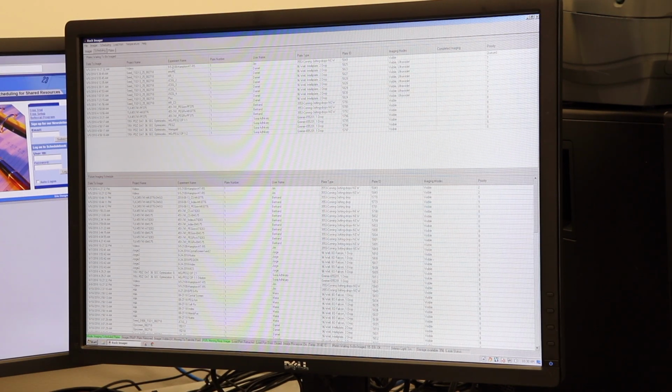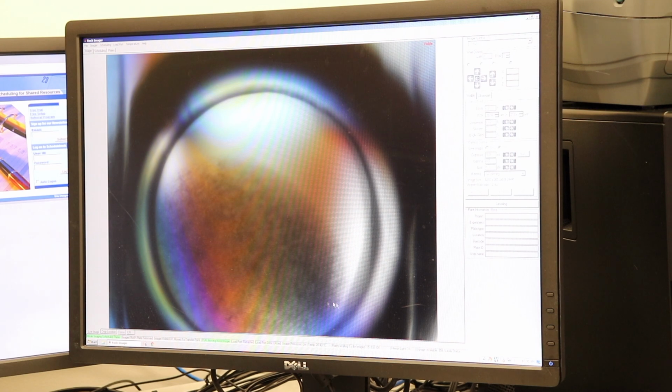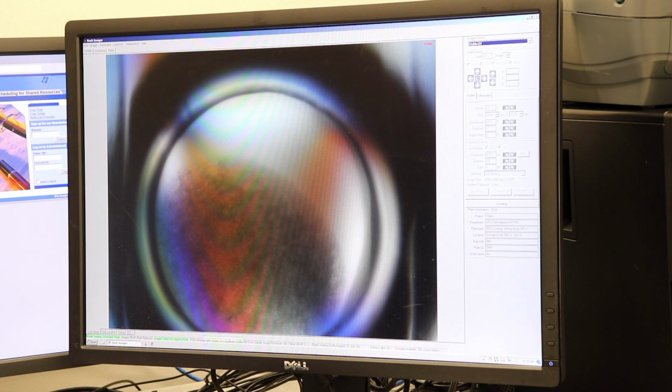Okay, so we see the plate at the top of the Scheduler tab, and now we can watch the plate get imaged at the beginning. So if we go over to the Imager tab here, it'll give a live image of the current imaging. And this imager control should be set to visible UV. If you look carefully down here in green text, it will tell you what it's currently doing. It'll align the plate and then take images of the 3 drops as we instructed it to do.